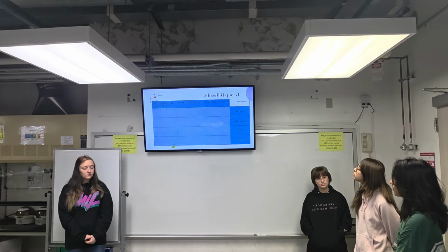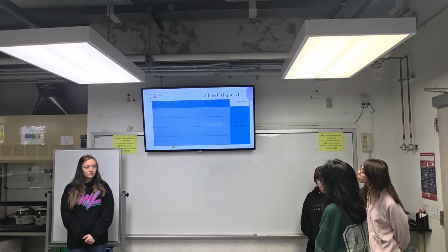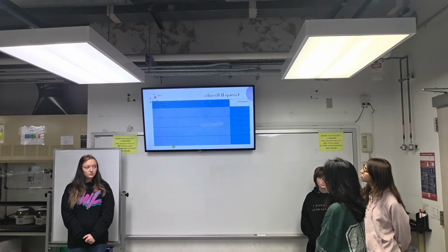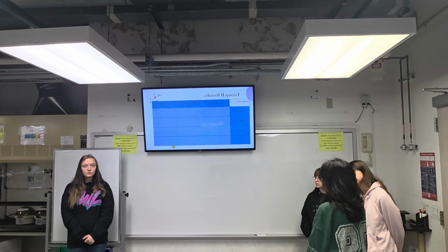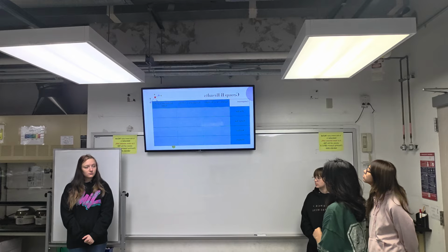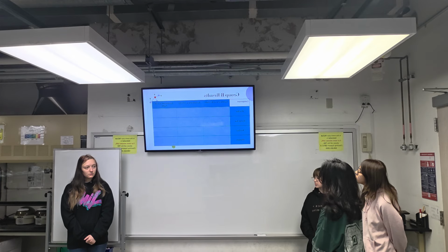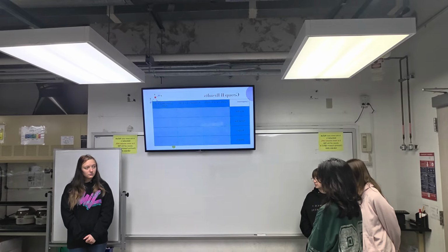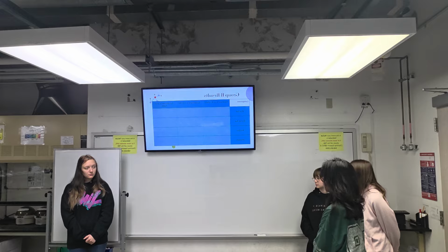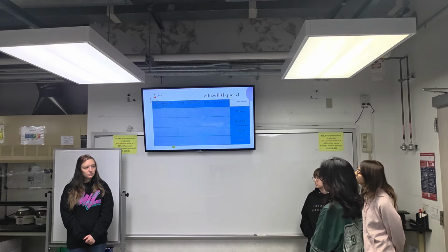These are our results, which are pretty similar. For the blue dye, you could probably see the most difference in separation. For the orange dye, it mixed a bit more. For the red dye, we noticed that red was the most vibrant. And for the mordant, it mostly went into the cyclohexane, whatever the DI.